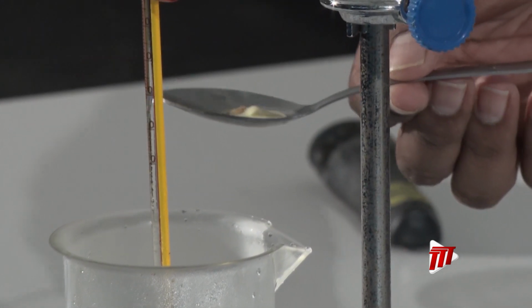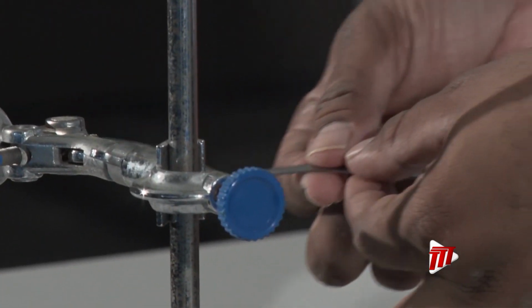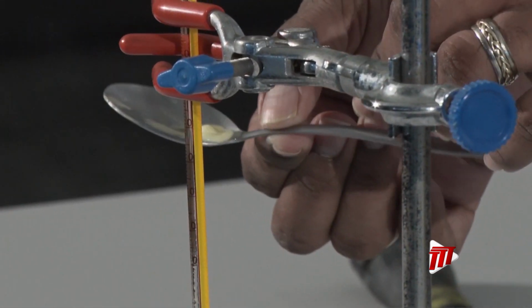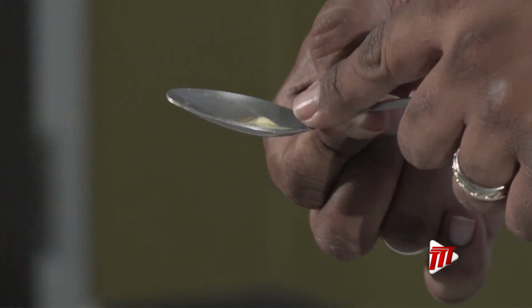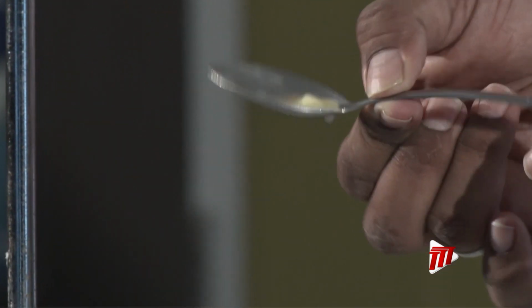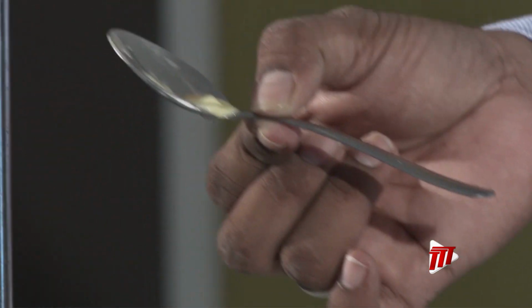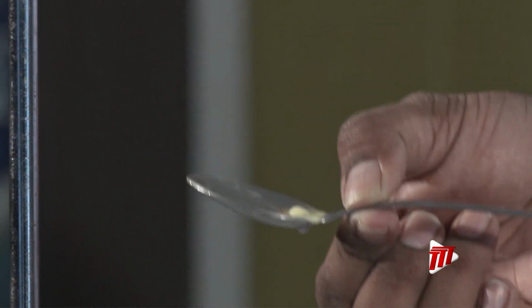After 5 minutes, we notice the heat from the hot water in the beaker has melted the butter and the bean. If we just shake it a little bit, you see that the butter and the bean would move and drop.